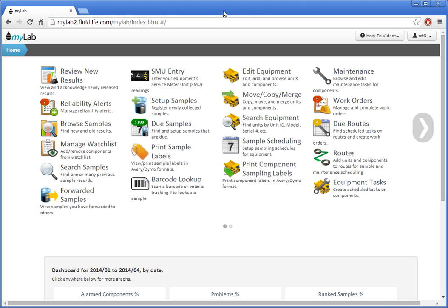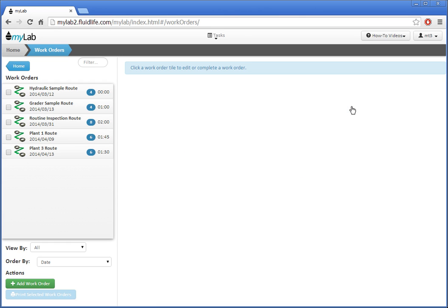Hello, in this video I'm going to show you how to complete work orders using FluidLife's myLab. First, I'll select work orders from the myLab homepage. Outstanding work orders are displayed in a list on the left.